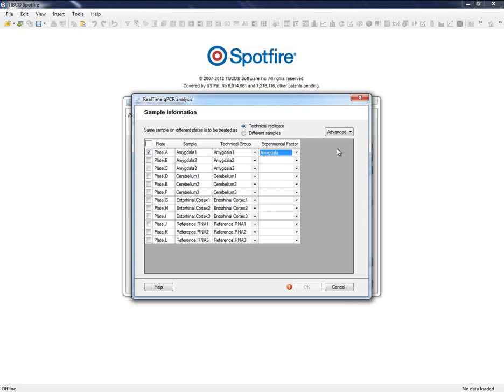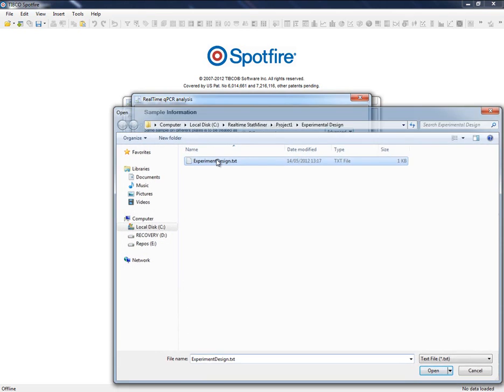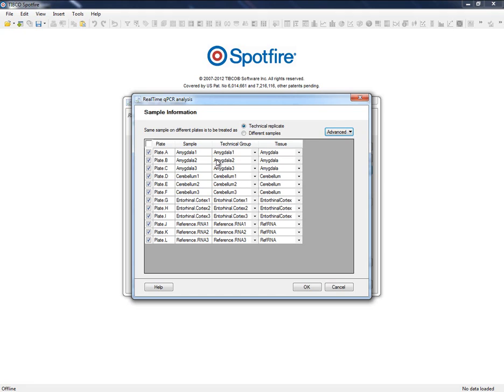Experimental Design video tutorial provides further details on how to create and save our own design, as well as dealing with samples distributed on different plates. That is all on the experimental design.